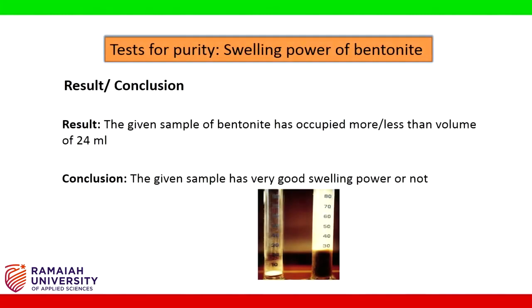Result or conclusion: the given sample of the bentonite has occupied, tick appropriately, more or less than the volume of 24 ml. Conclusion: the given sample has a very good swelling power or not. Write the appropriate answer.